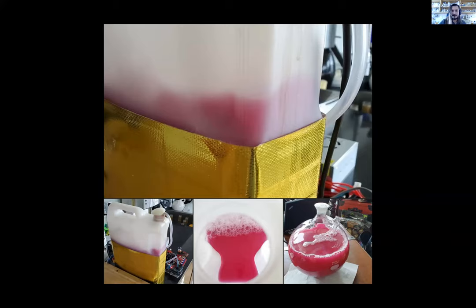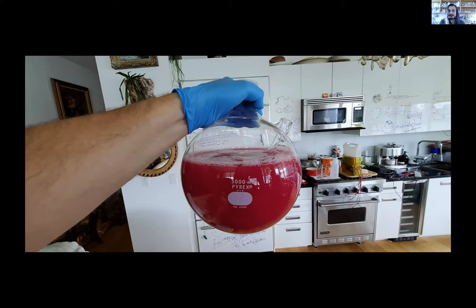And so I put a single colony of RFP into 4 liters of LB media. I turned on the device, and I said a quick prayer to every god I can think of, including some Lovecraftian horrors. And the next day, lo and behold, it was super pink. I've actually never had a culture this rich with cells before, and they were all expressing RFP beautifully. I made 4 liters. This was my baby. I was super proud of it. I showed this to my client, and they're like, Did you build a bioreactor in a week?